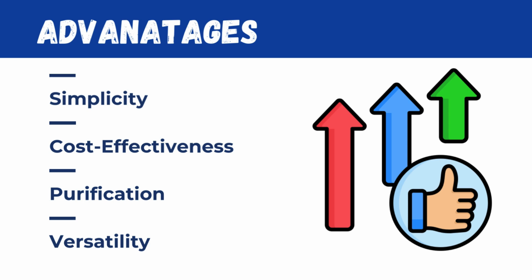Okay? And the last advantage is versatility. While it may have limitations, simple distillation is versatile and finds application in various industries, including the production of alcohol and the purification in laboratories. So guys, these were the 4 main advantages of simple distillation.